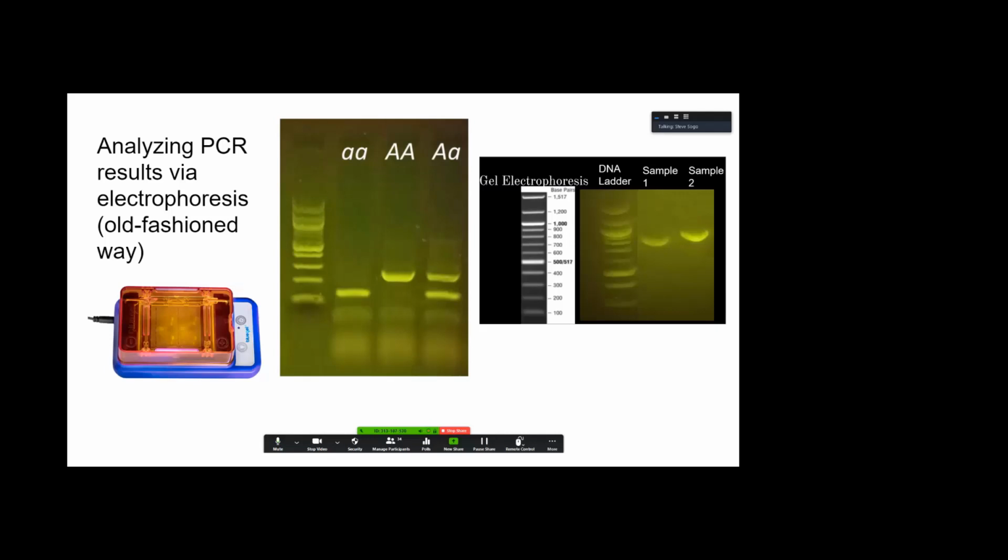This on the left is what are called molecular weight standards. Here they're labeled. So these are our number of bases in the DNA. So this is 500, this is 600, 700, 800, 900, 1,000 bases in the DNA. This one here, if you understand genetics, these are, I'm almost certain, from humans.